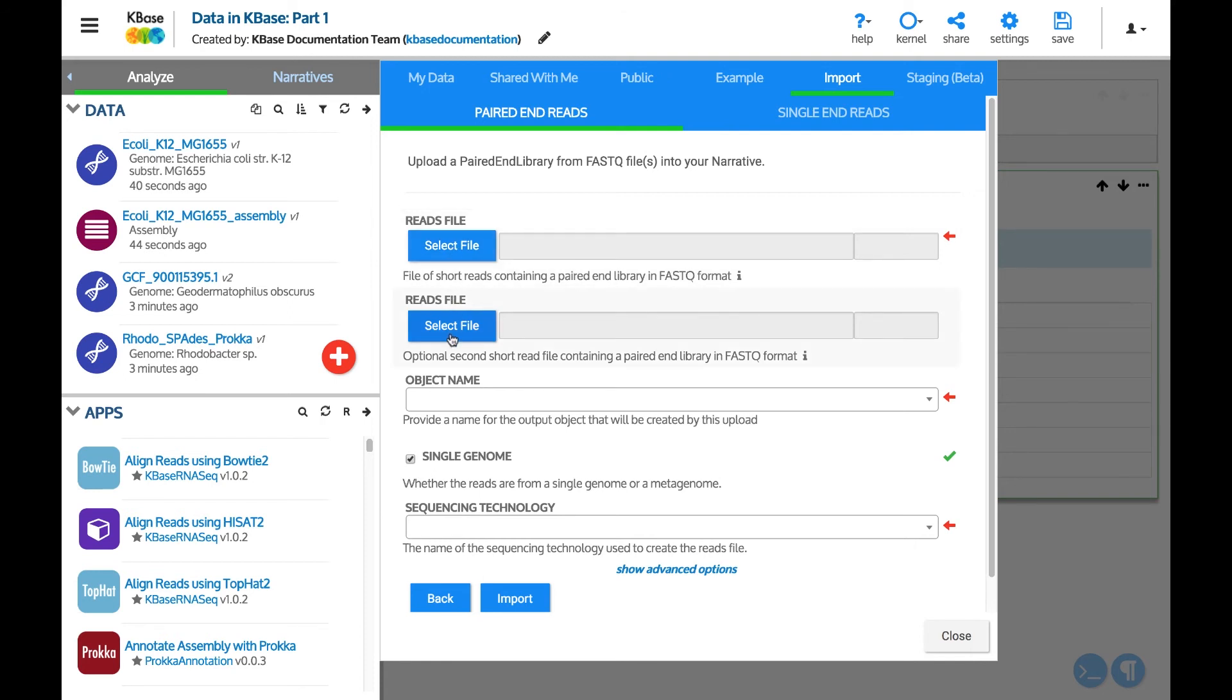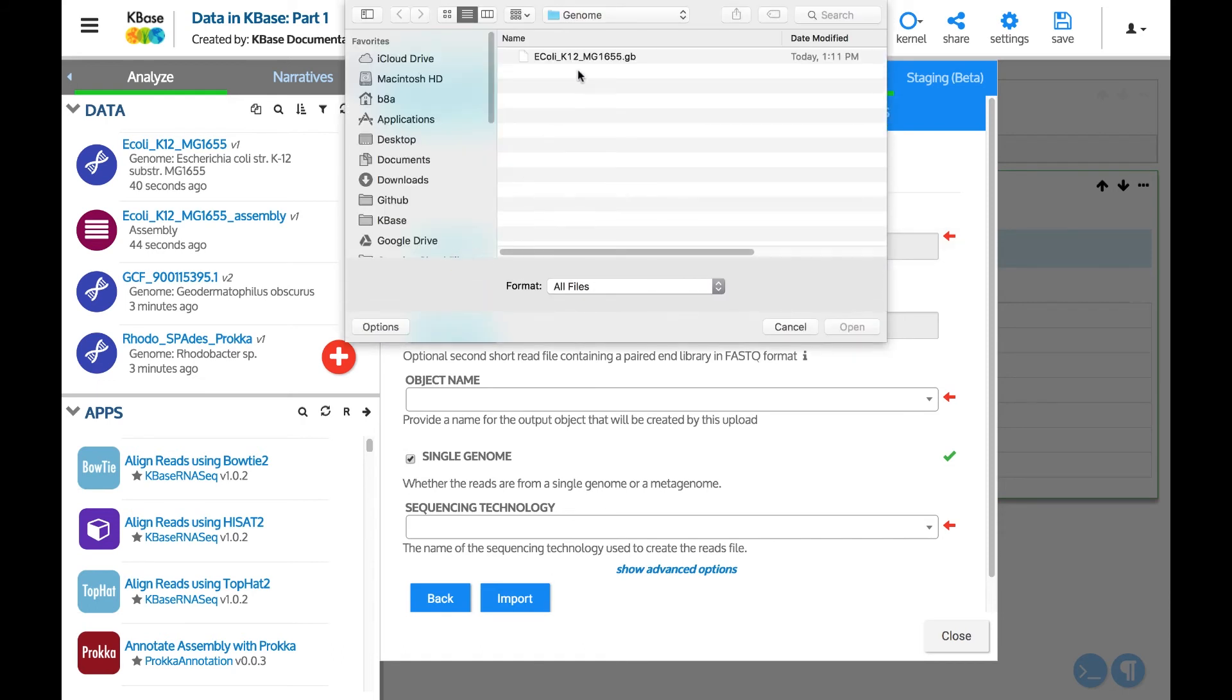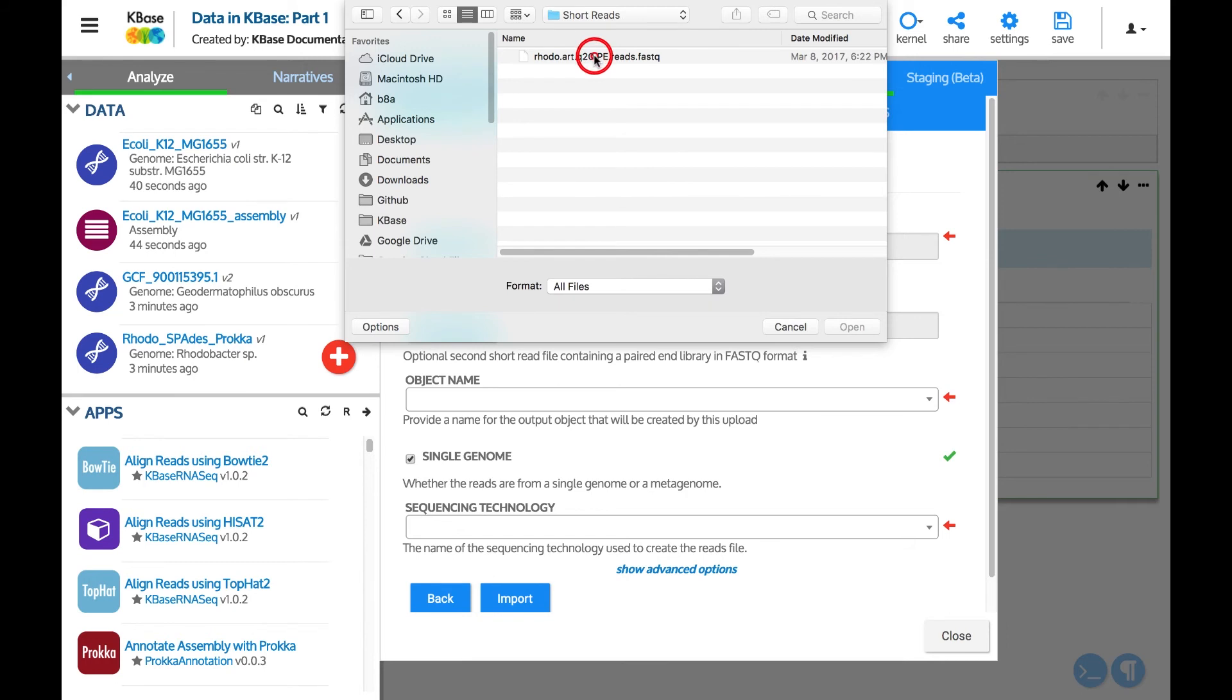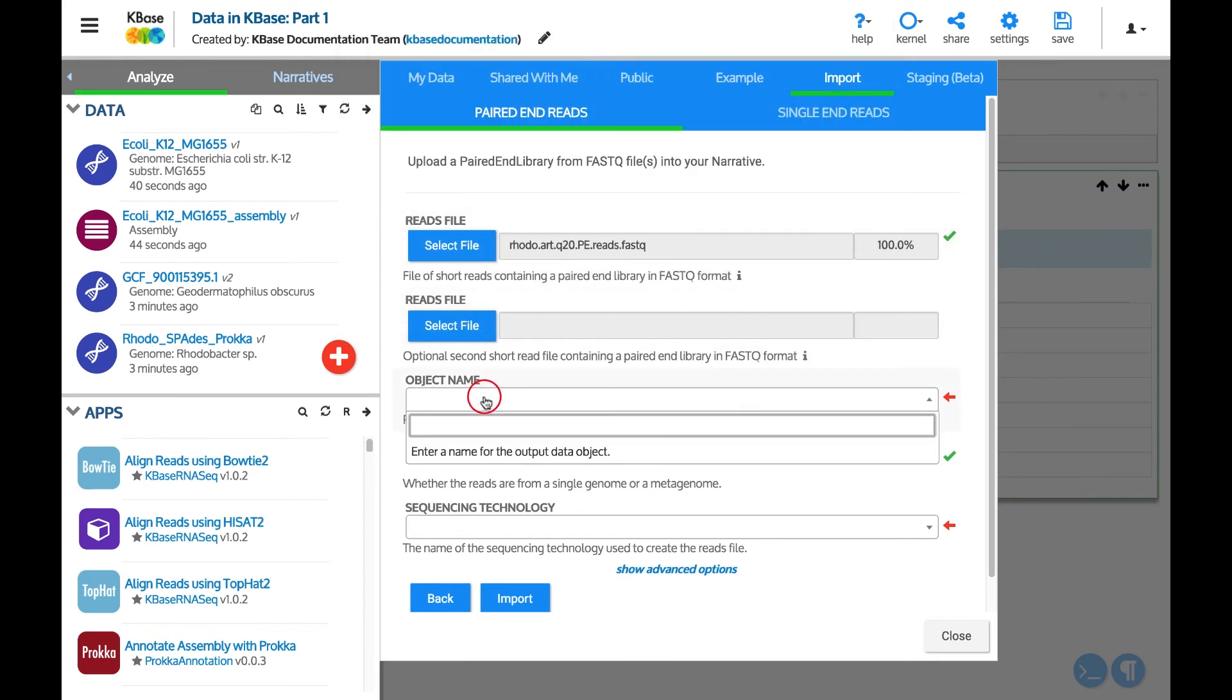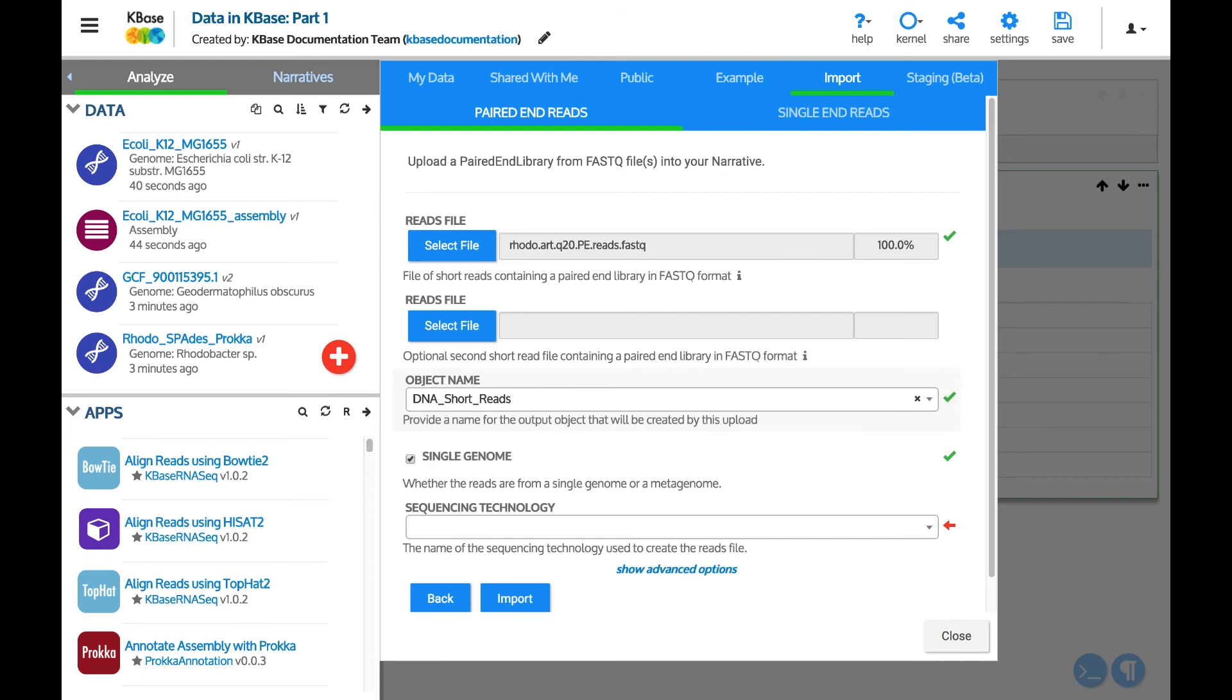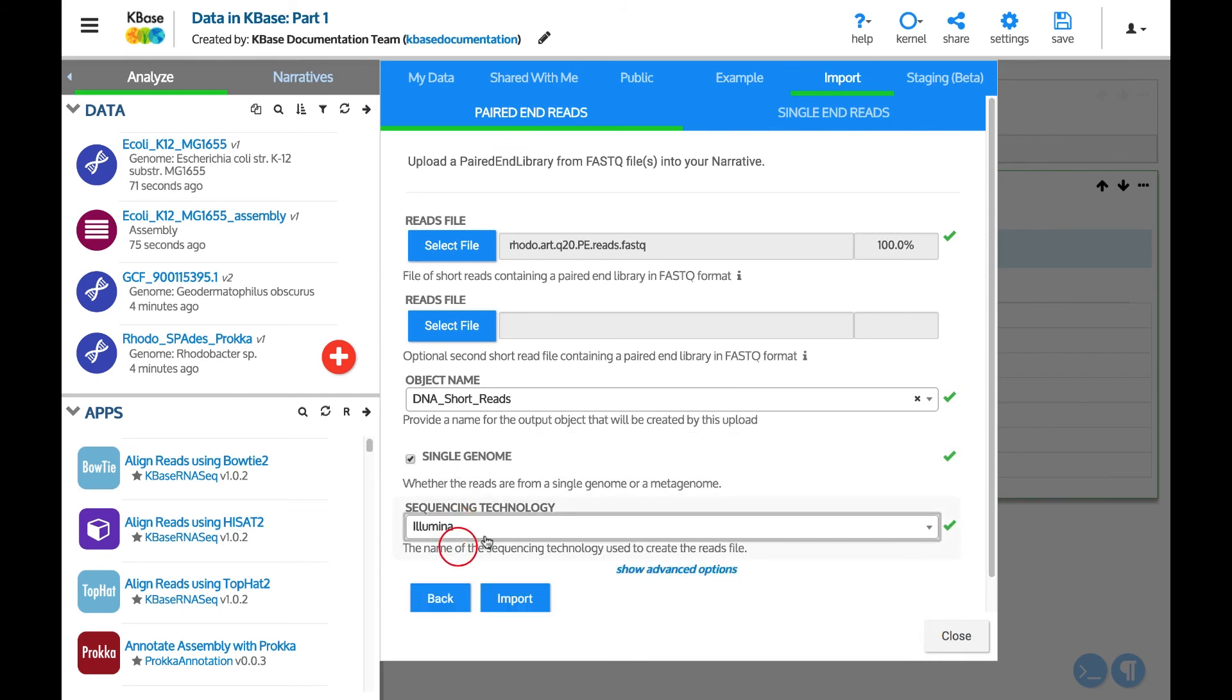Paired end reads can be interleaved into a single file or contained in two separate files for the forward and reverse reads. If only the first file is populated, the reads file will be treated as an interleaved file. Give the reads a name. Make sure that the box for single genome is checked and then select the sequencing technology used to generate the reads. All fields are now complete and ready to start the import.